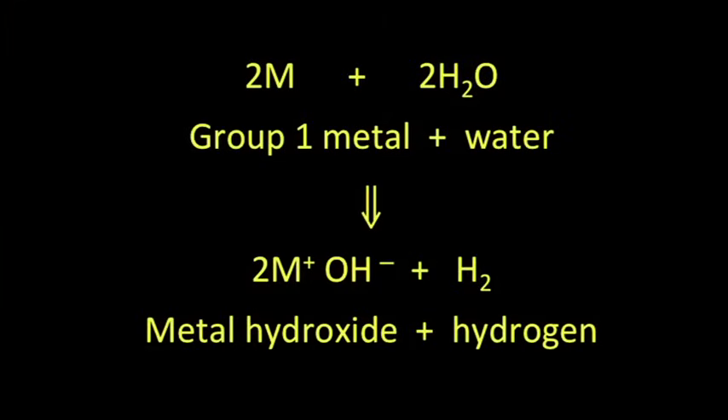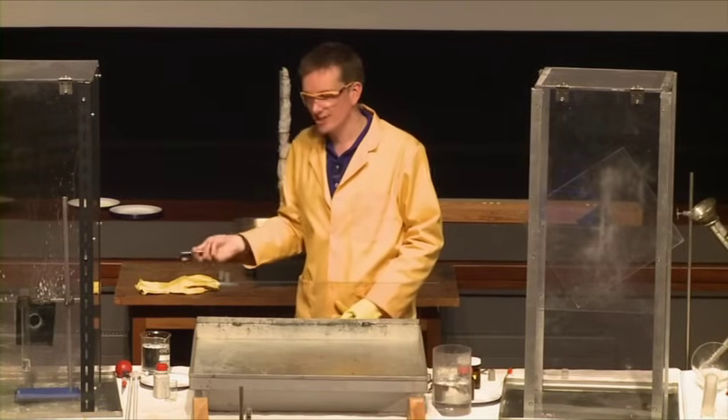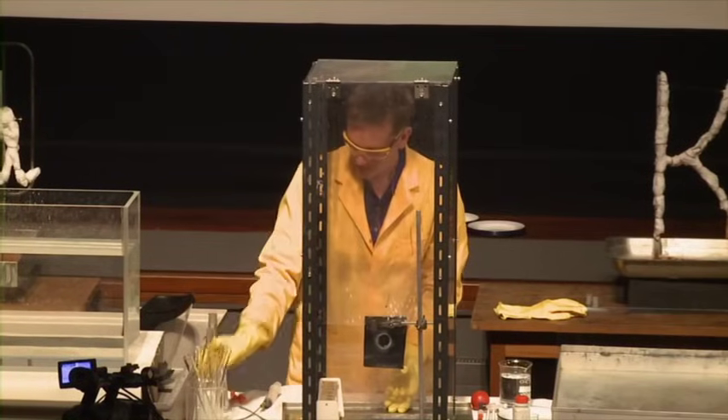So every time it's the same equation. But what we're trying to do now is see if we can tell the difference between the reactivities of the different metals. So out with the lithium, in with the sodium.